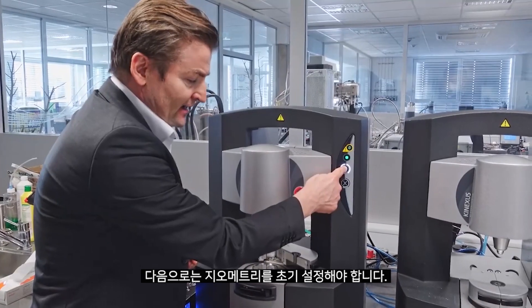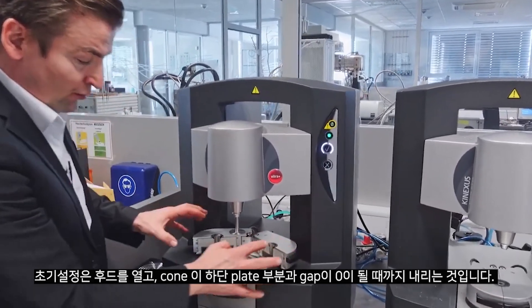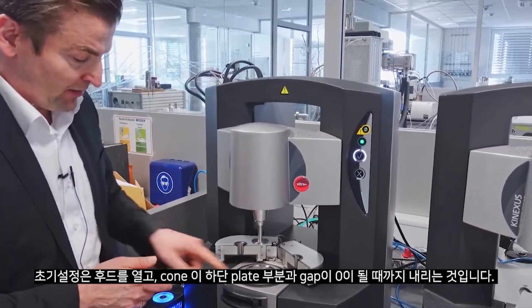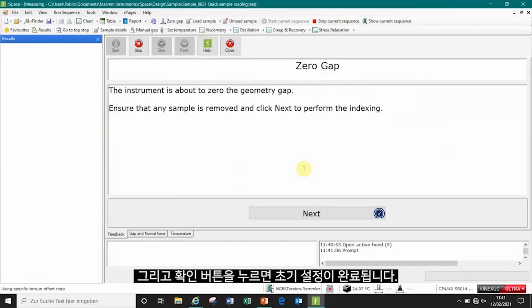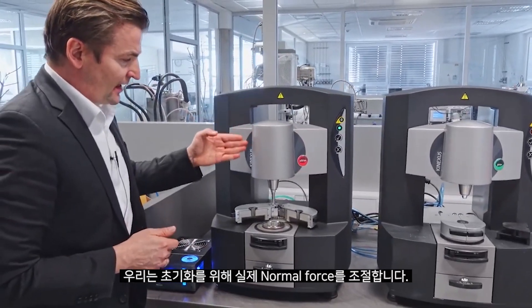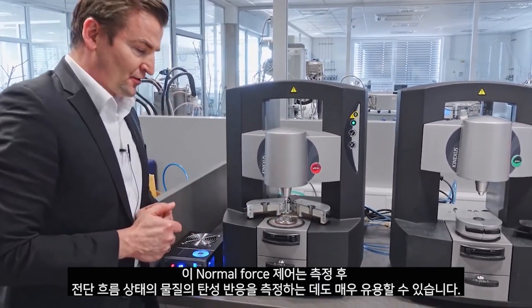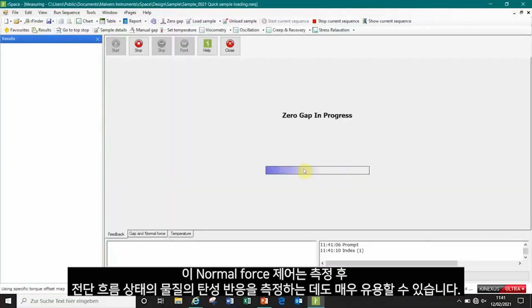Next I need to initialize the geometry. The hood is detected. We need to zero the upper cone onto the lower pedestal plate, and by pushing the OK button this will be done. We are using our actual normal force control to initialize. This normal force control can also be very useful to measure the elastic response of our material under shear flow, which we will see afterwards in our measurement.